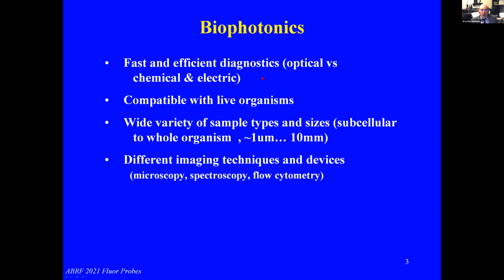Here the aim is to provide fast and efficient diagnostics that is compatible with live organisms, that covers a wide variety of sample types and sizes, ranging from subcellular to whole organism, and a scale size on the order from micron to tens of millimeters. It is also related to different imaging techniques and devices such as microscopy, spectroscopy, flow cytometry, and even sequencing, as Guillermo mentioned earlier.